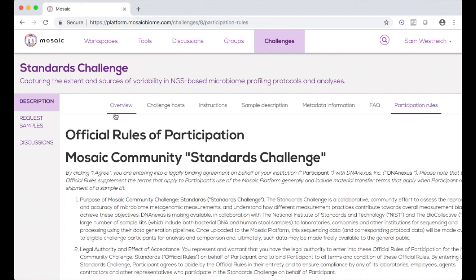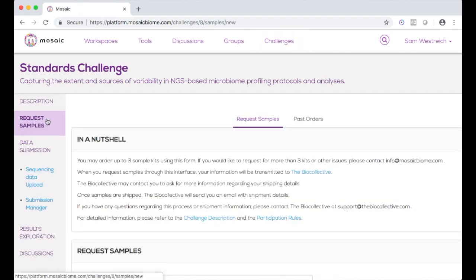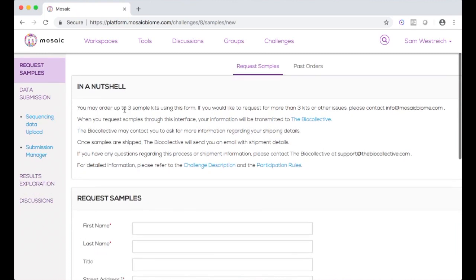In order to join the challenge, simply come over here on the left hand side and select Request Samples. When you first navigate here, you will receive a prompt that asks you to accept the rules of the challenge in order to join. After you have accepted those rules, you will find this order form that allows you to place an order for a sample kit.